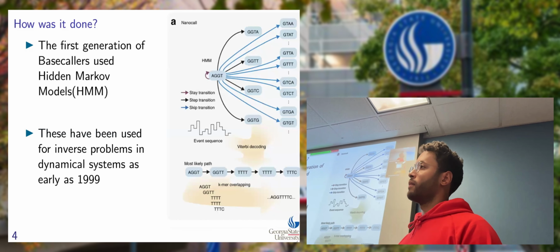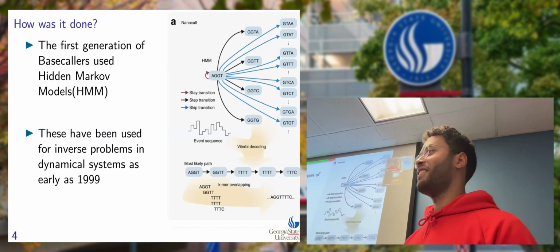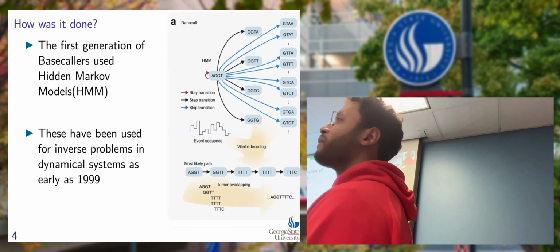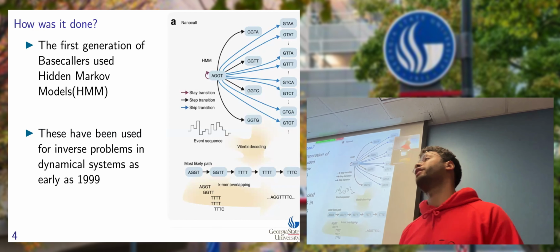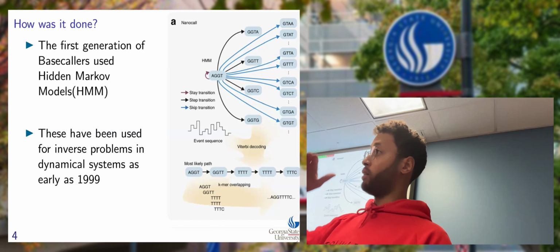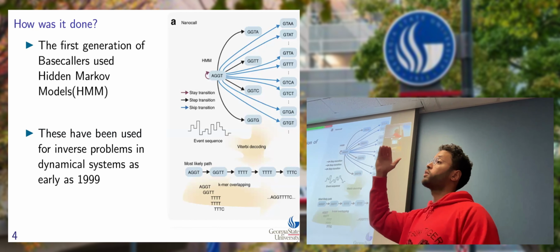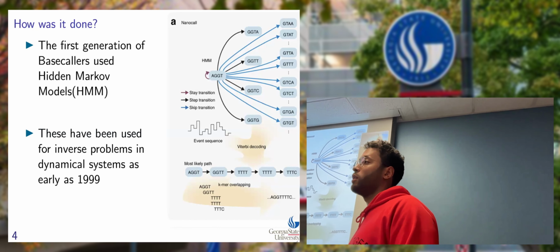Excellent. What else? You mentioned something about the signal itself. Yes. The value of the signal, the amplitude. What happens as we progress in time? As we progress in time, the signal can actually shift. The signal is not only noisy, but it can shift. Even though you're still seeing the same bases, the electrical signal can deviate from what you understood it to be.